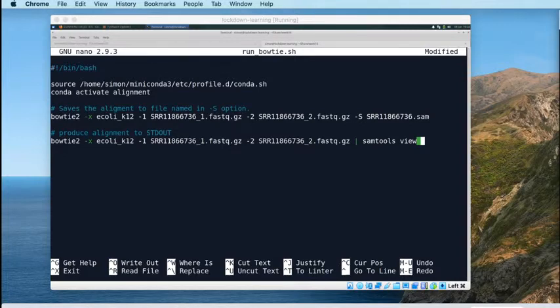So what's that? That's about 65-fold coverage of the E. coli genome. So if you take that number of bases, divide it by the number of bases in the genome, you get around about 65-fold coverage on average of every base in the E. coli genome.